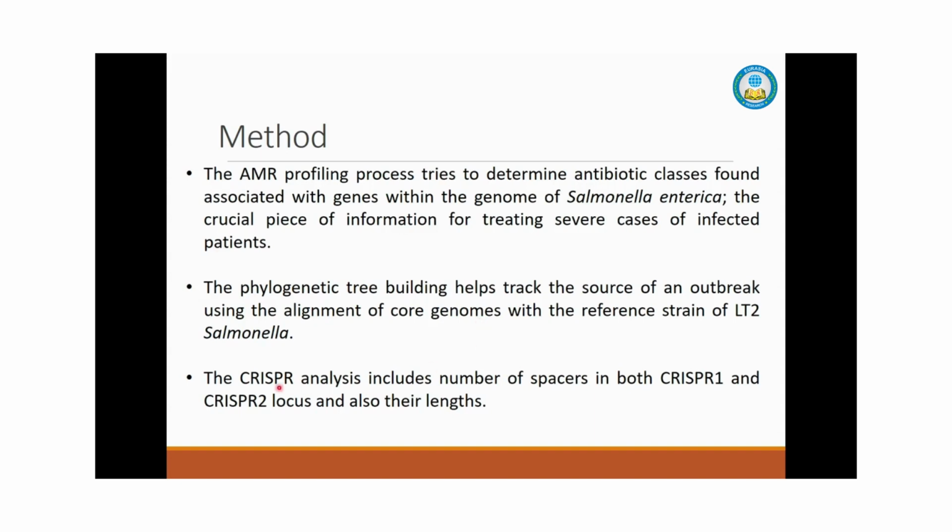The CRISPR analysis also includes the number of spacers in both the CRISPR1 and CRISPR2 loci, and also their lengths.